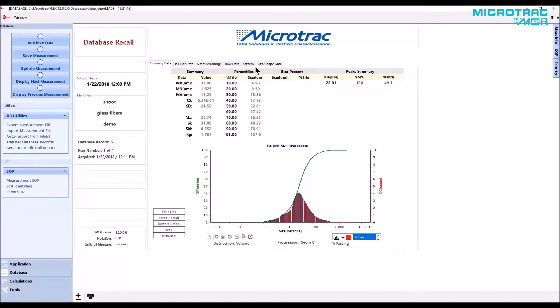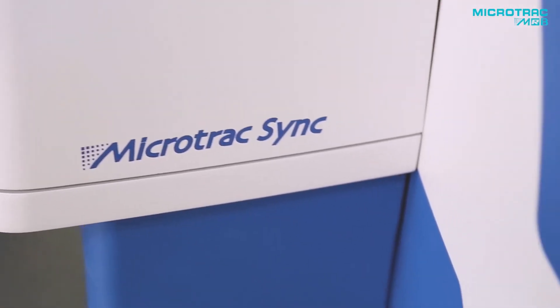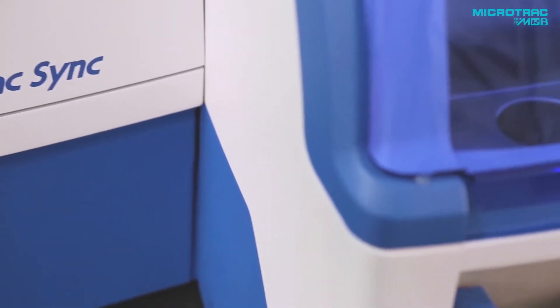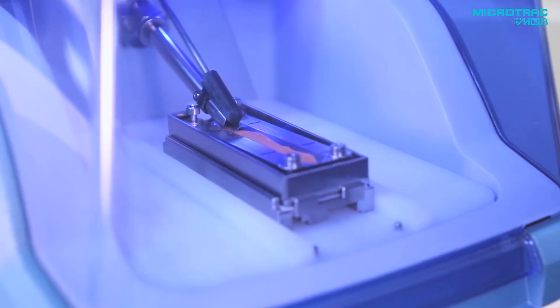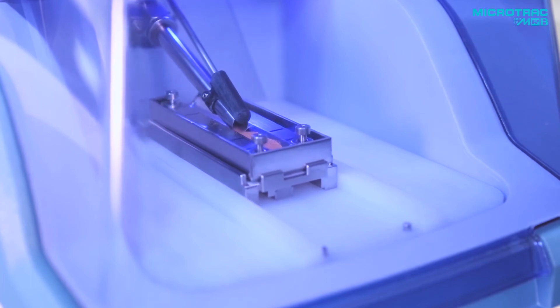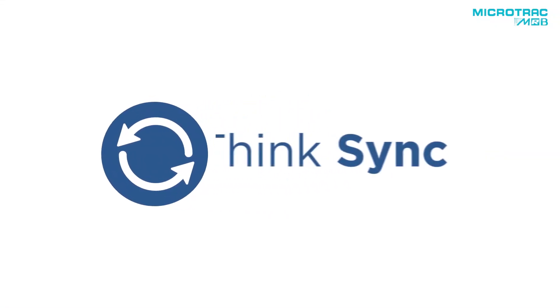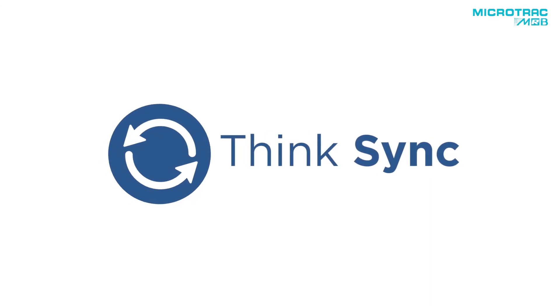Up until now, laser diffraction has provided the industry with the most used and most reliable methodology for particle size. Users who wanted more information, like shape, needed to perform measurements on different technologies. The Microtrack sync has changed that. The industry's most reliable size measurement is now combined with the most sophisticated shape information in a single instrument. Whether your sample is wet or dry, big or small, regular or irregular, think Sync.